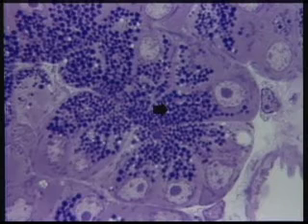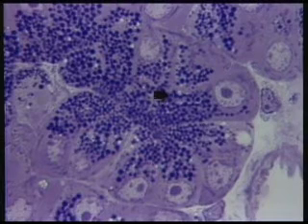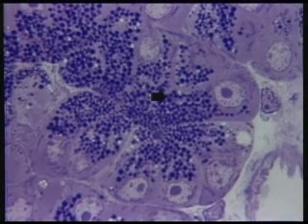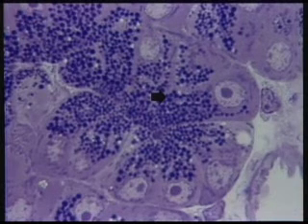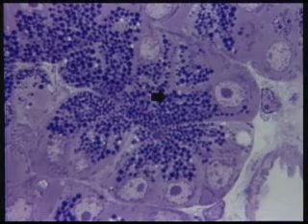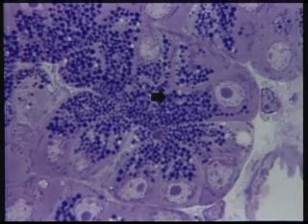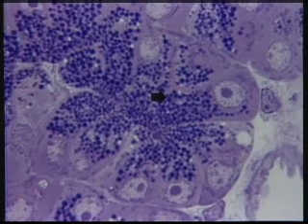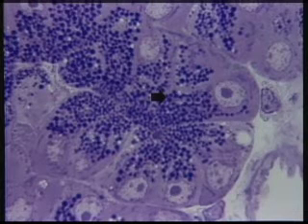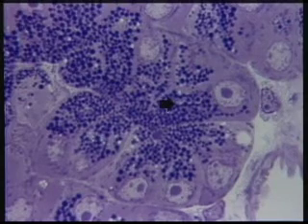What are these little dark structures here that look like sort of purplish black circles? Another one here, here. What are these called? These are secretory granules. This particular image is of the acinus of a pancreas. It's filled with pancreatic acinar cells, and the rough endoplasmic reticulum down here is manufacturing the secretory granules, which are up in here.